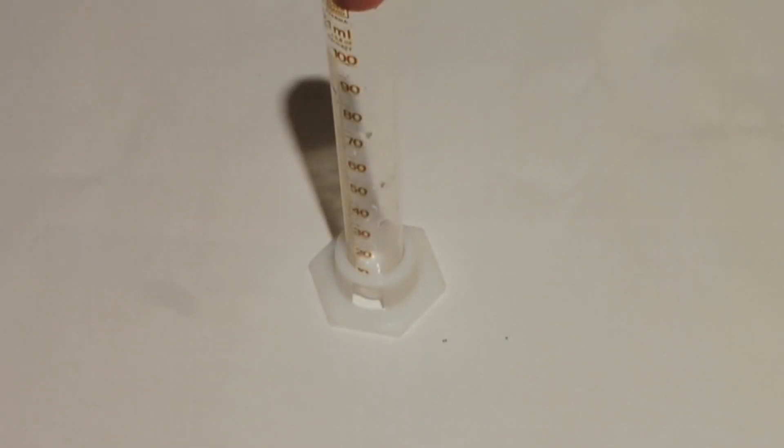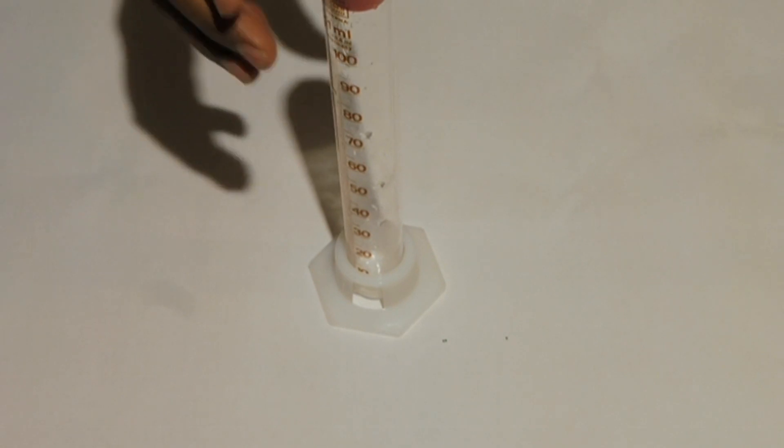Take the measuring cylinder, also known as a graduated cylinder. Remove the base so that the cylinder lies flat on the bench.